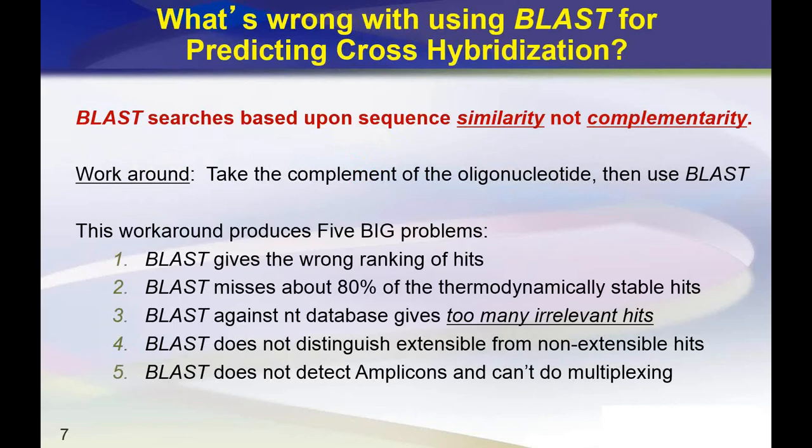Furthermore, BLAST does not distinguish between a hit that is extensible versus one that's non-extensible by a polymerase. And we'll see that that's very important for the design of primers versus probes.